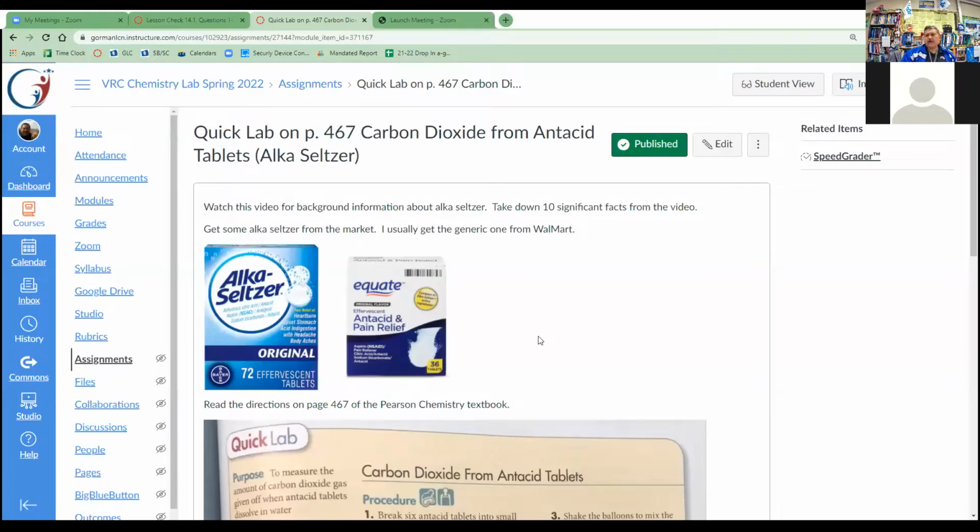Okay, so welcome to VRC Chem Lab, and today we're going to do the lab on page 467 of the Pearson Chemistry text, and it's called Carbon Dioxide from Antacid Tablets.